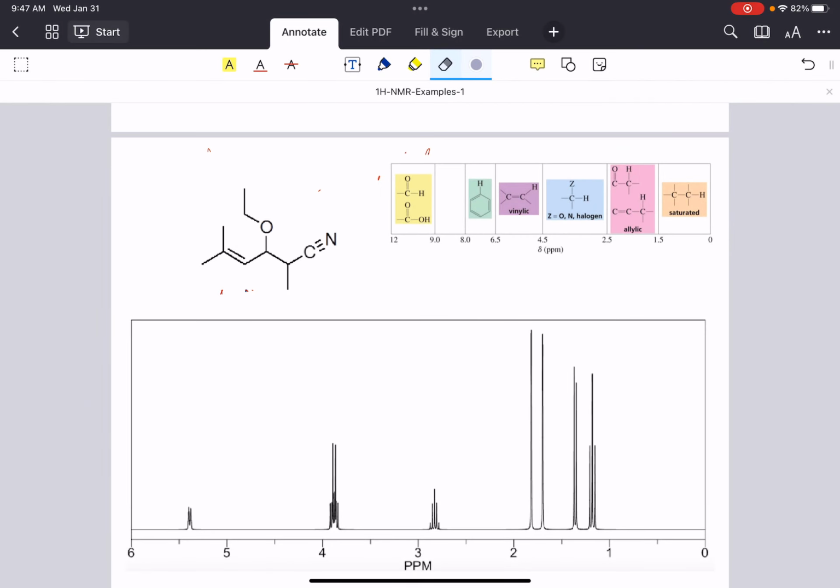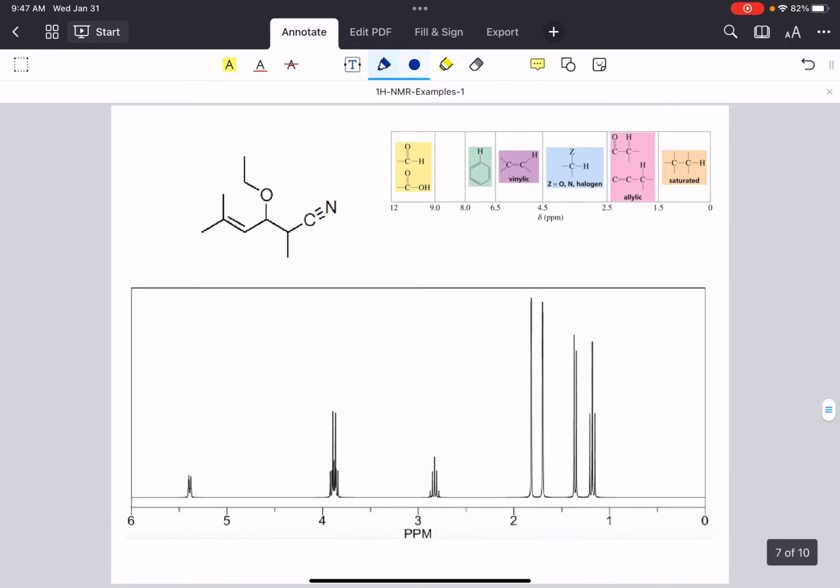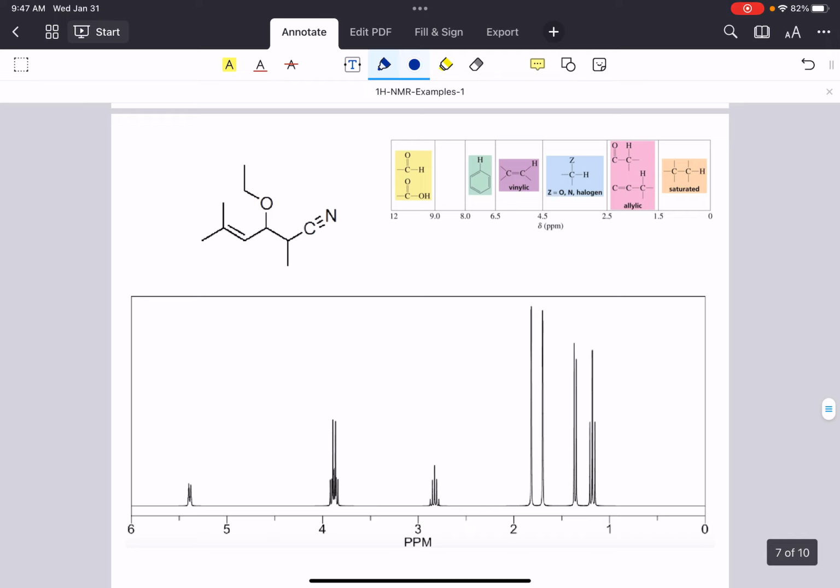All right, so we're going to start here with part 2 of this video where we're talking about assigning chemical shifts for specific signals corresponding to these small molecules. So we're ramping up complexity in this last couple of examples in terms of things we have to think about.